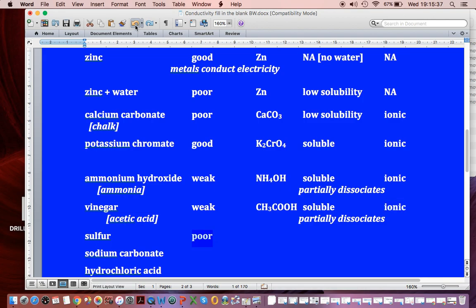Sulfur. It's going to be a lot like the zinc. It was poor. Formula S. It didn't dissolve at all. And ionic or covalent doesn't really apply, or molecular.